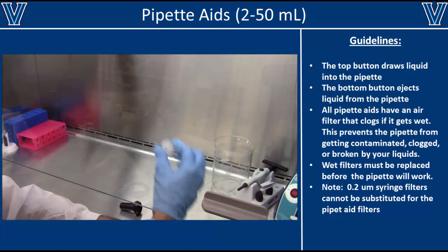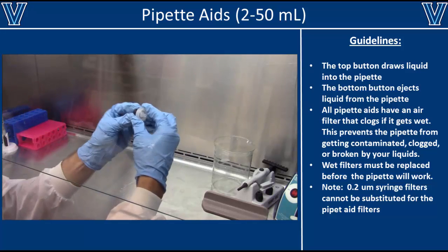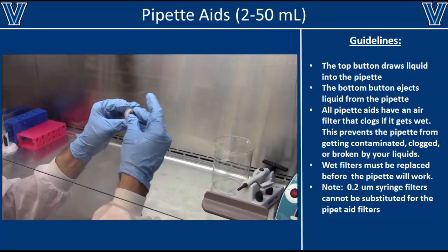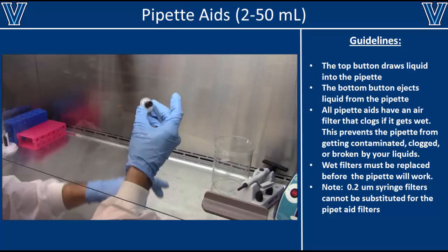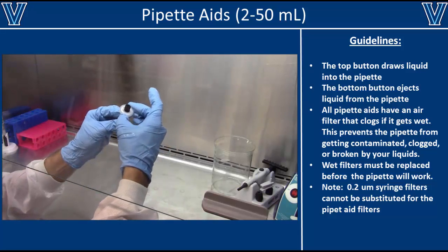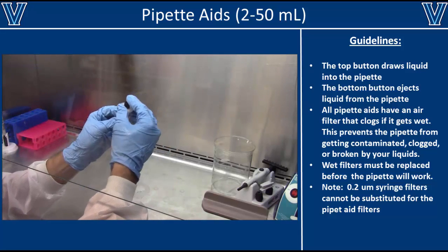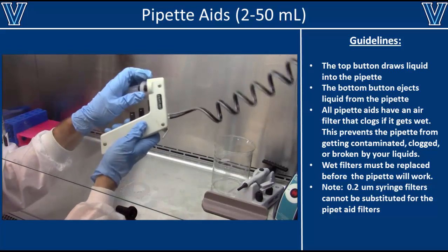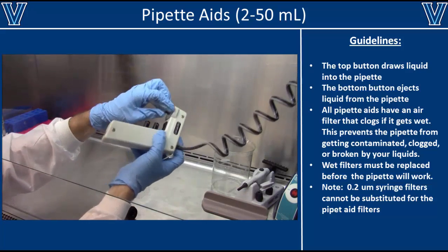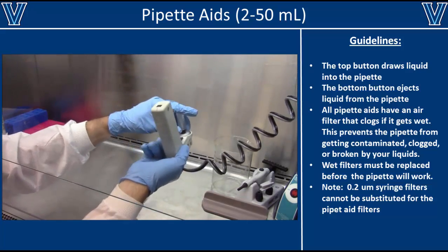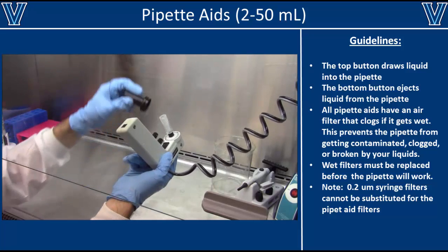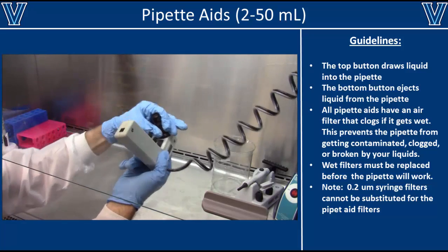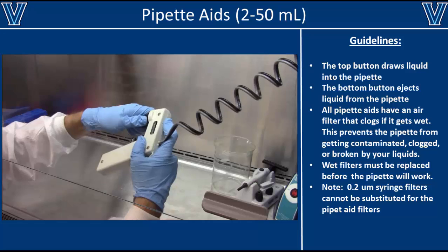Once you have removed the old clogged filter and thoroughly dried all the plastic pieces, reassemble the pipette aid, making sure that the new filter and all the rubber pieces are in the correct orientation. Once you put it back together, test it with some liquid to make sure that it works. If the pipette aid continues to malfunction, let your supervisor know immediately.